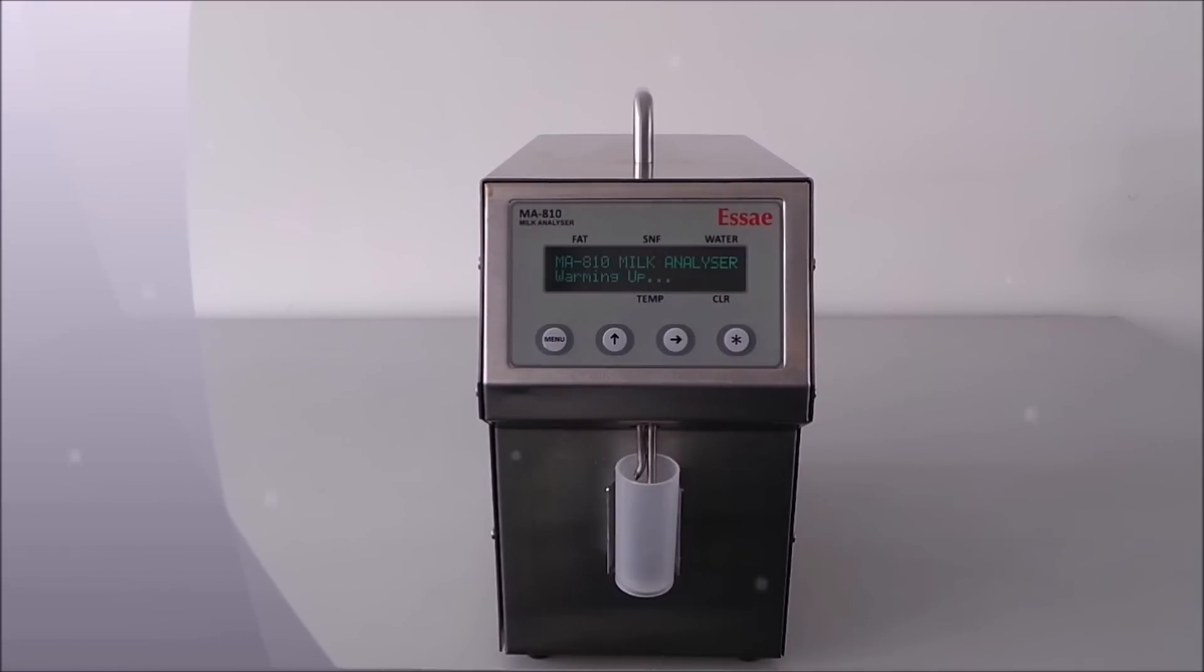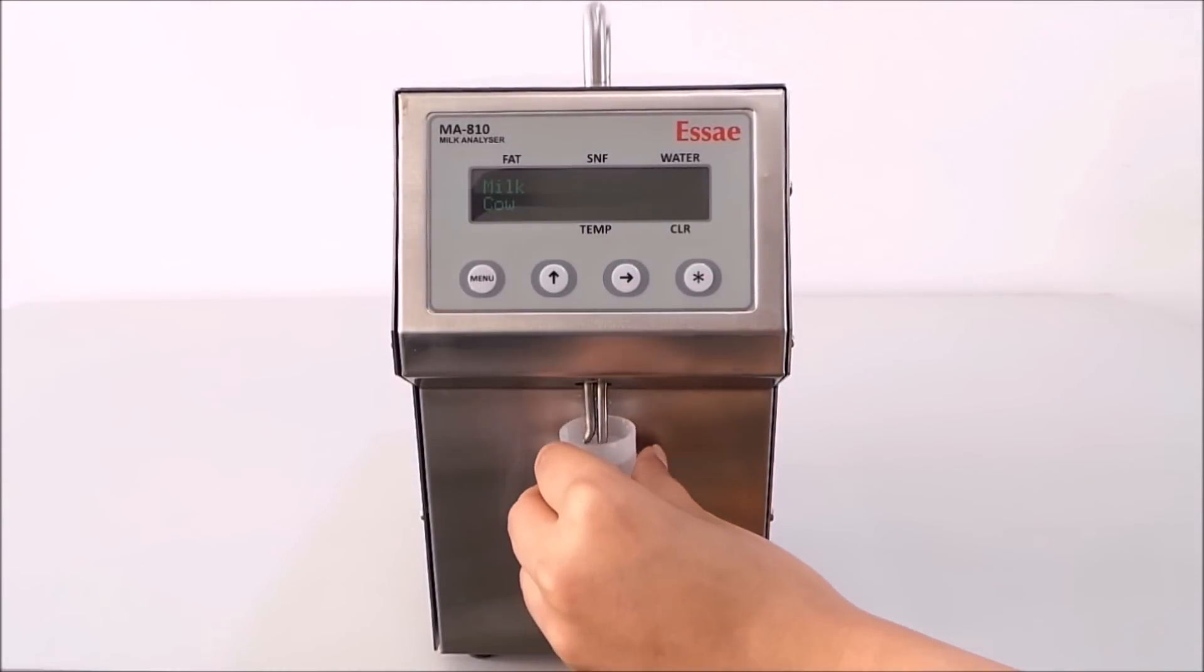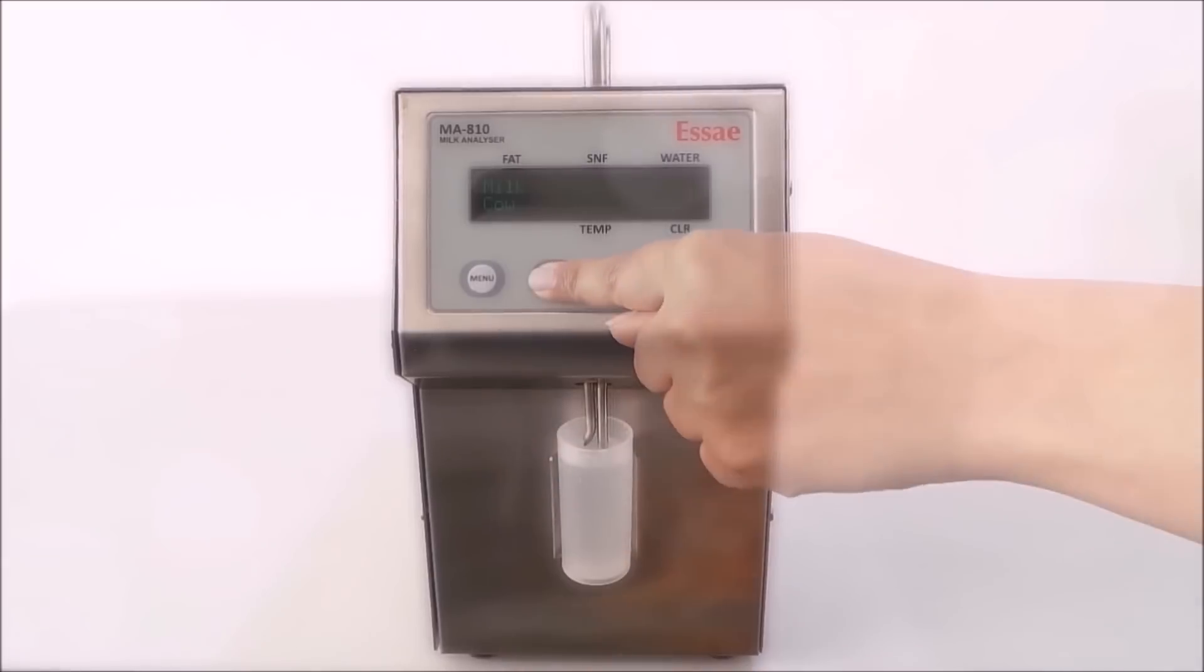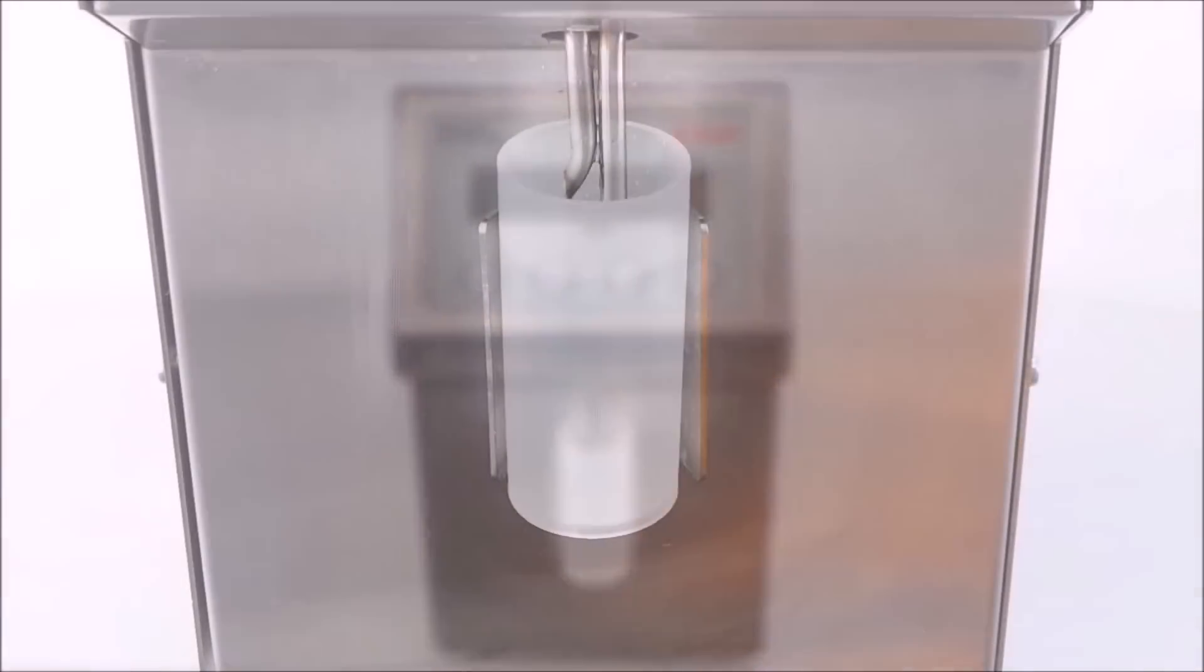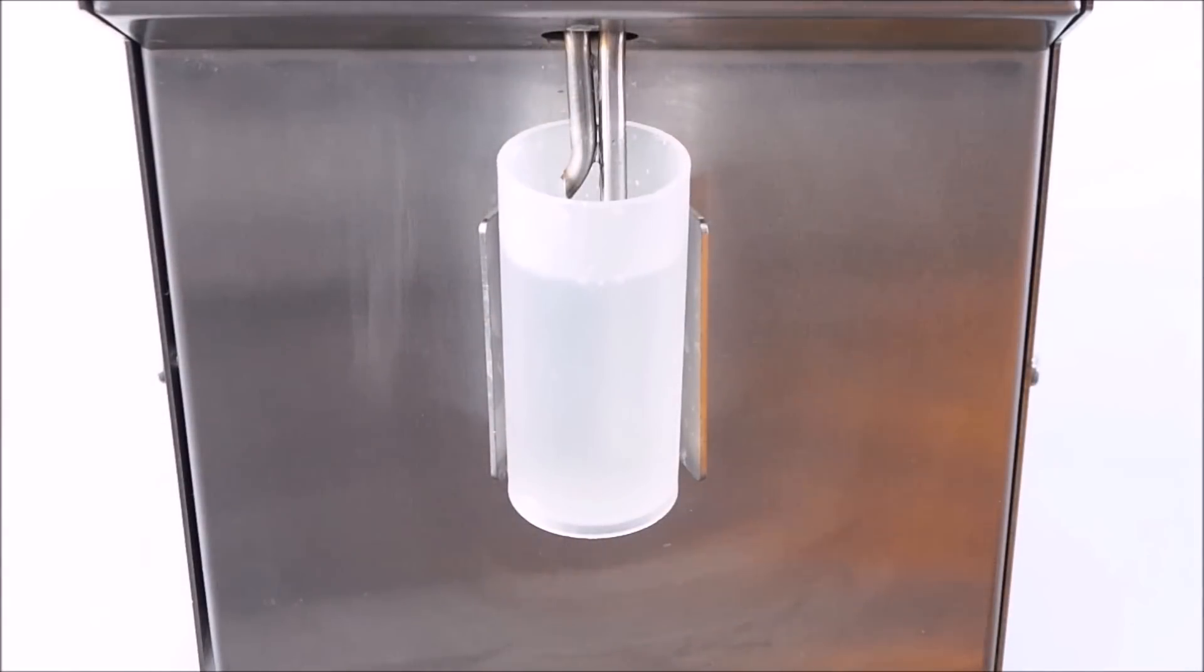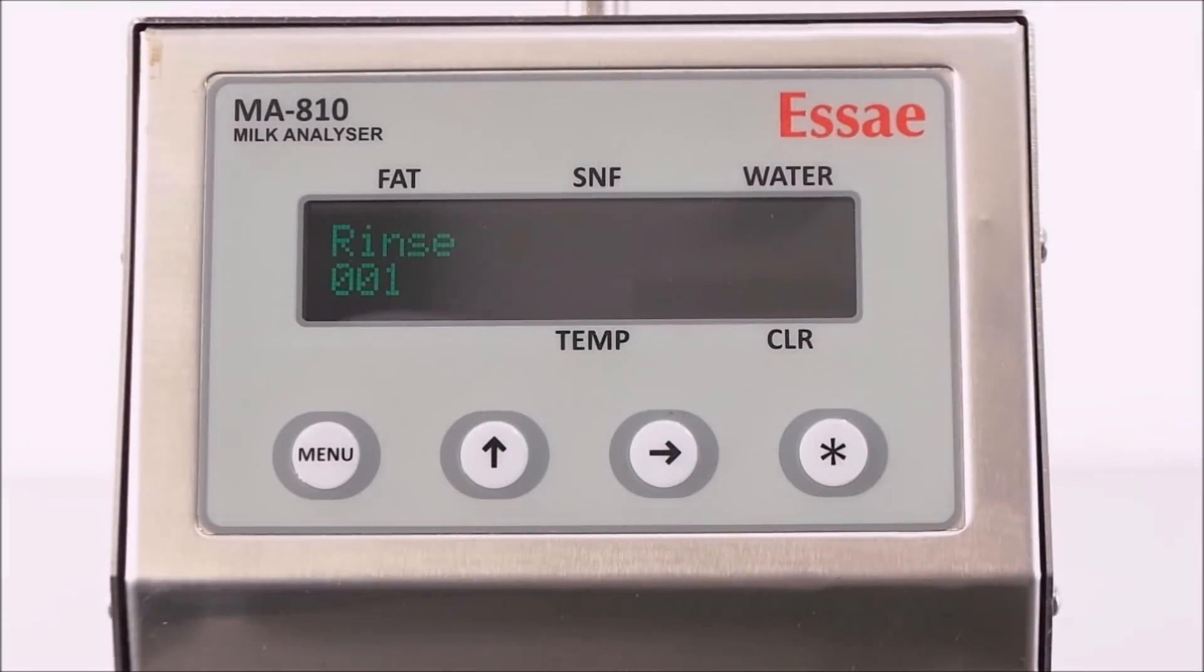To clean the machine after analysis, place the container filled with clean water and press the up arrow. The inlet pipe will take the water in and release the water after cleaning. Please note that the machine should be rinsed with clean water after every shift. Daily and weekly cleaning should be done as per the instruction in the manual with recommended solution. The same process will continue for 5 times and the countdown will be displayed on the screen.